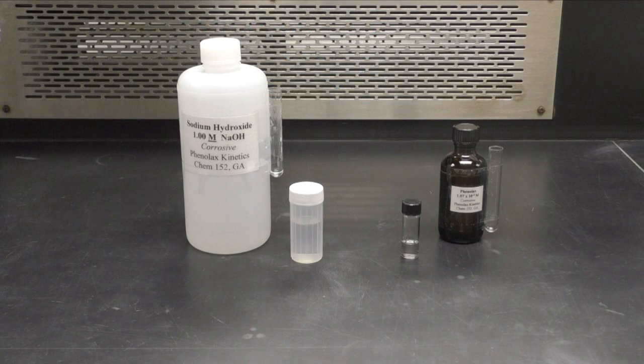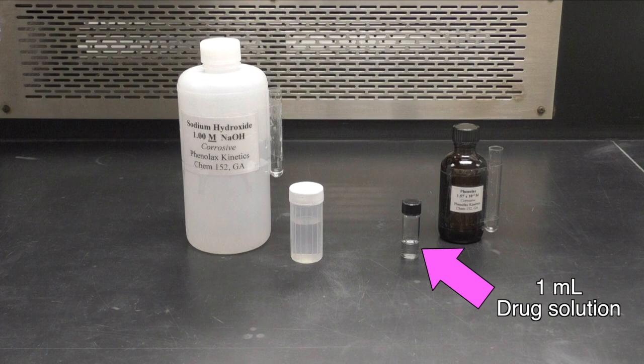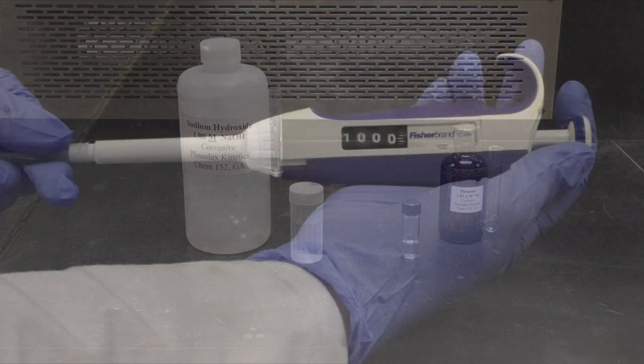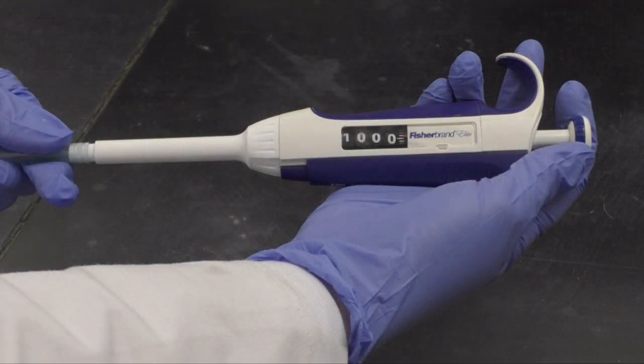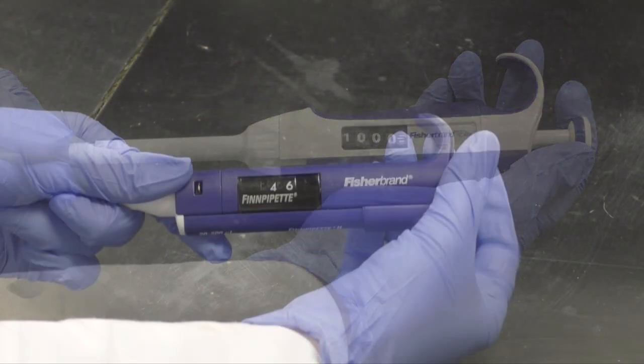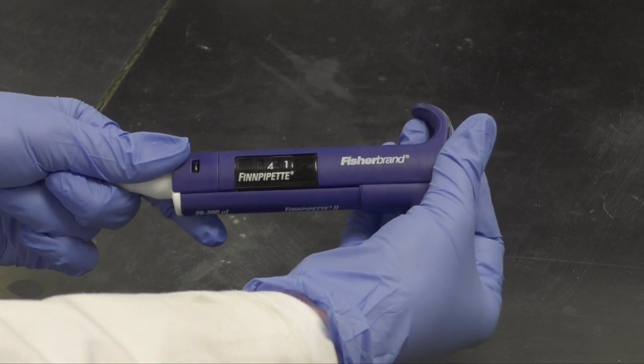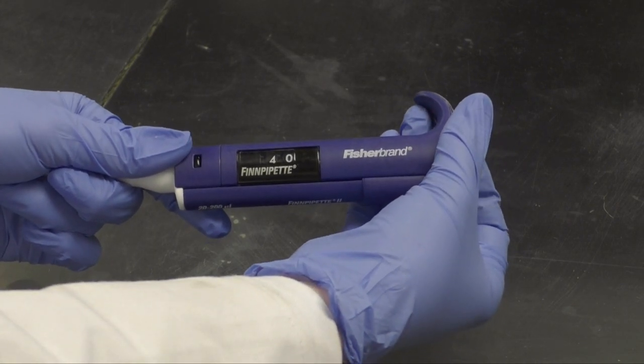Now you can begin preparing your sample. First you will need to transfer 1 mL of your drug solution into a clean 1-dram vial, and about 10 mL of sodium hydroxide to a 20 mL plastic vial. You should set up your micropipettes with your desired volumes before you begin to make running the reaction quicker.